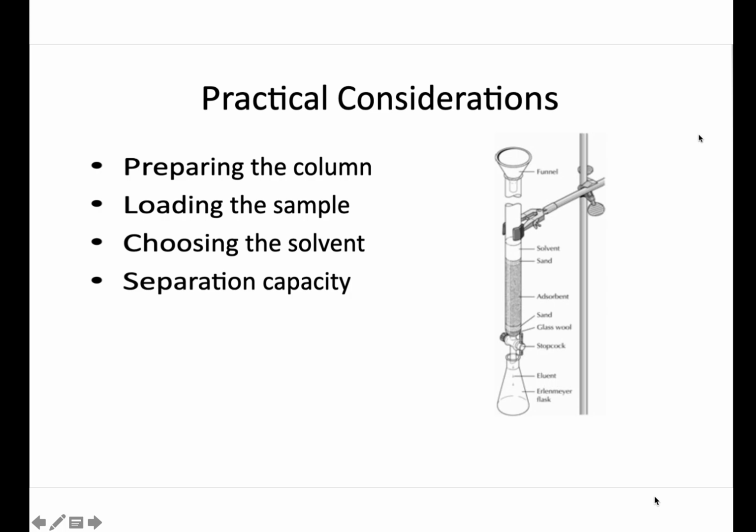Remember, don't forget that you must never allow the mobile phase to pass beyond the upper level of the stationary phase. Otherwise your stationary phase will be dried and you cannot fix it easily. When you have bubbles trapped in the stationary phase, that means this part is paralyzed. It doesn't help you with the separation, and this bubble of air will not easily escape.